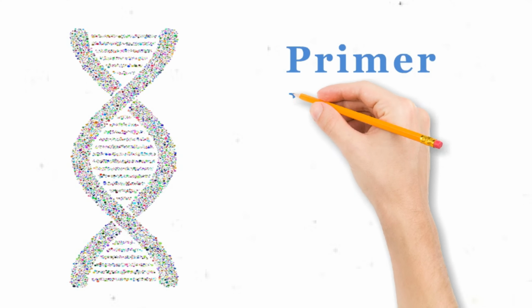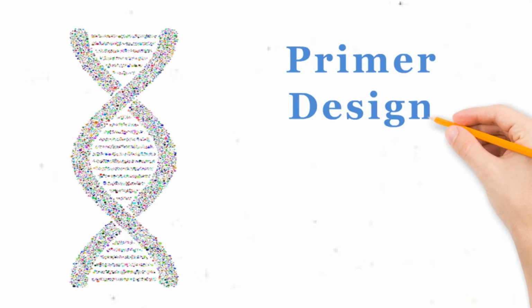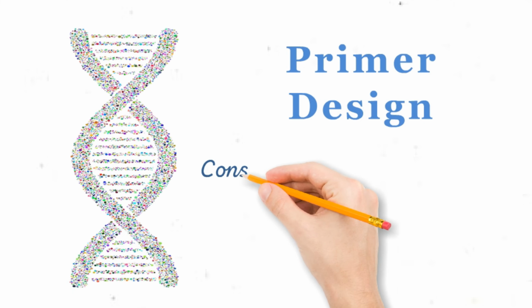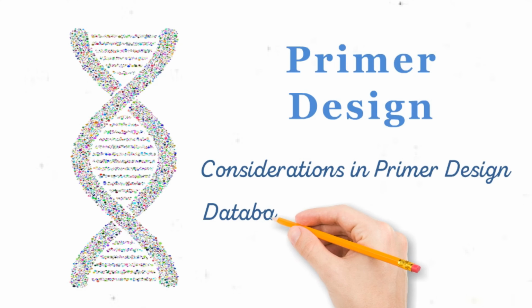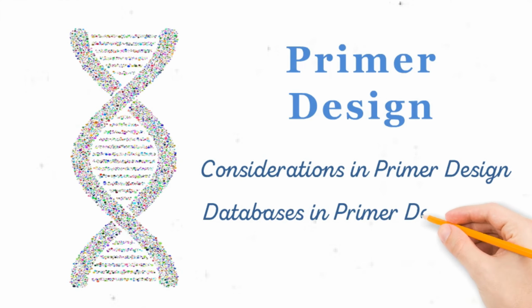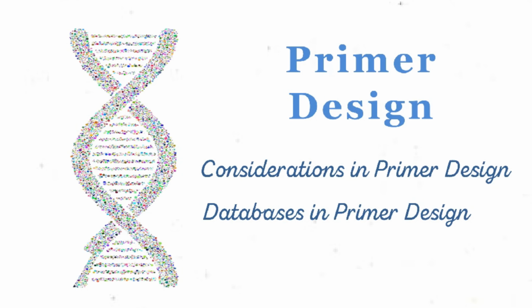Today we're going to dive into a foundational topic in molecular biology, primer design. Primers are essential for techniques like PCR, where they allow us to amplify specific DNA regions. This video will cover the basics of primer design and introduce some useful databases to help you design primers for your experiment. So what exactly is a primer?